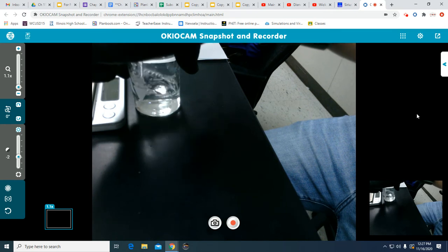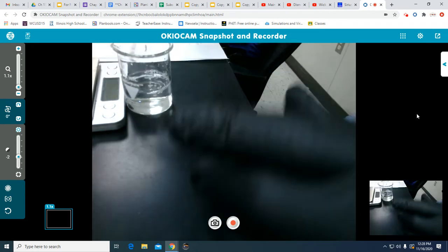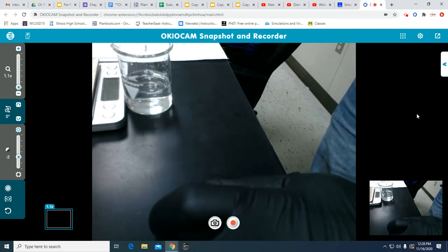It's a lot easier if you use water that's been set out at room temperature than if you get it directly from the tap. And plus, with the type of water that we're using, we make it in-house, so there's going to be little to no contaminants in the water.